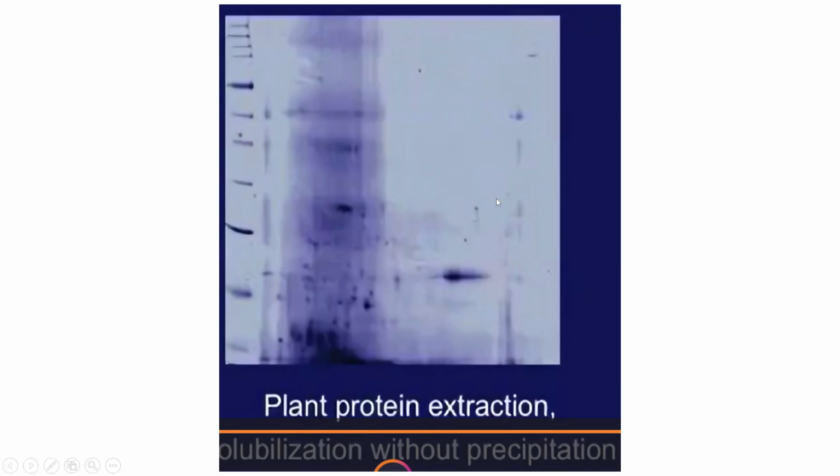If you follow those pre-processing steps, equilibration steps, and a specific voltage properly, and have control studies equally, then it will help you to have a good study. These are certain equilibration problems if you are not doing it properly.